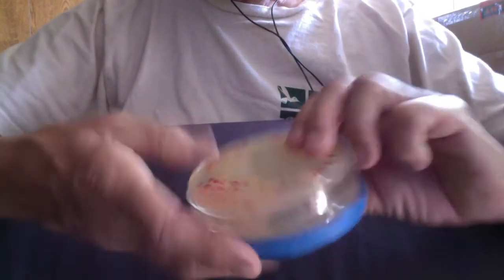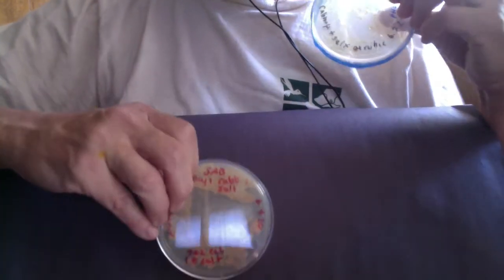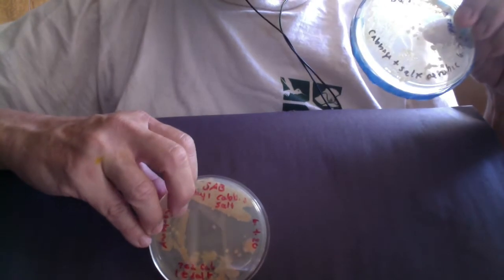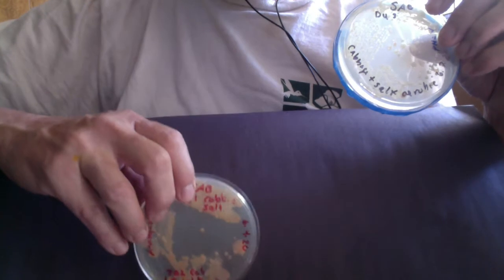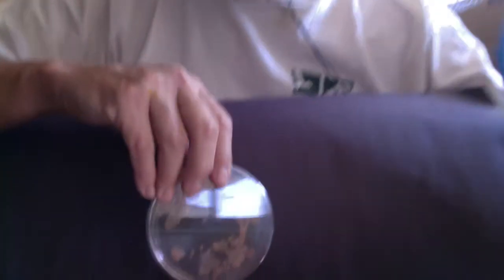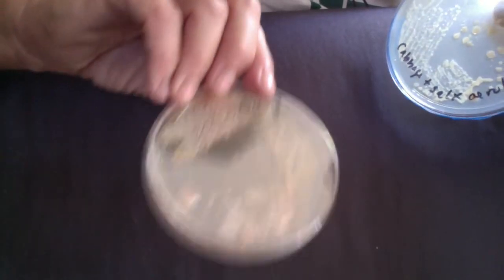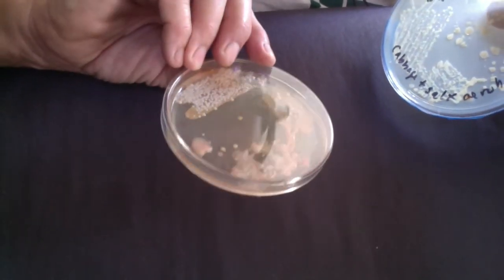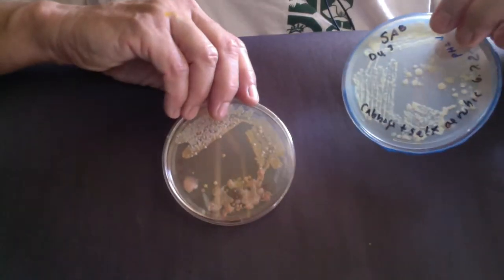So first of all, we're going to compare. This was our day one Sabouraud's dextrose cabbage plate, and you'll recall that this selects for fungi — so yeasts and molds. On day one we saw a lot of mucoid growth. There were some beautiful pink and purple colonies, an orange colony, a white colony — so a great variety of microbes were growing on day one. This was the cabbage and the salt.